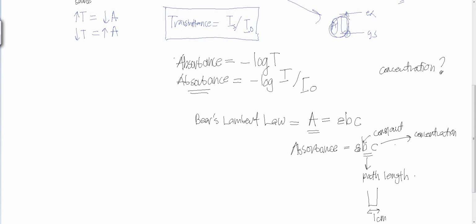Okay, and then molar absorptivity automatically, like I already mentioned, this is constant, okay? And then you know B, so usually 1 cm because of the kelebaran of the cuvette, the one that we put our sample in, right? So automatically we can calculate C.